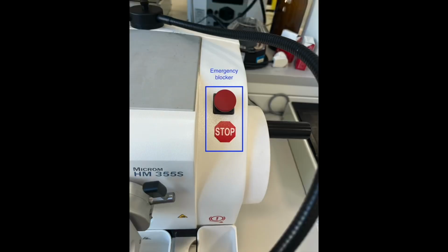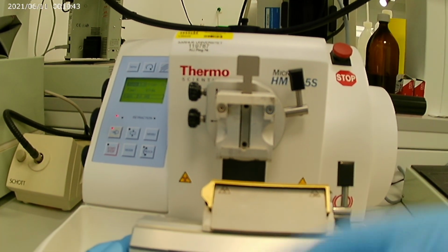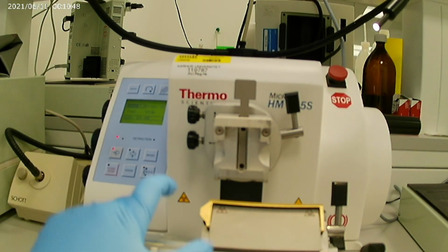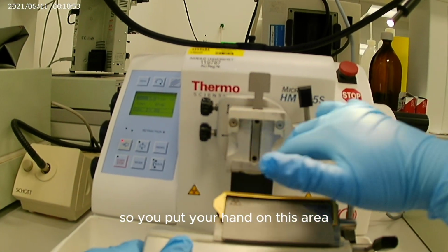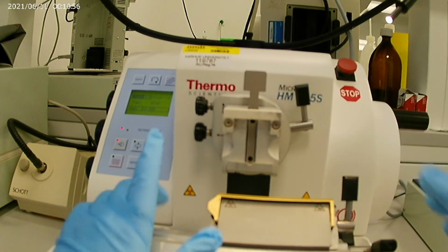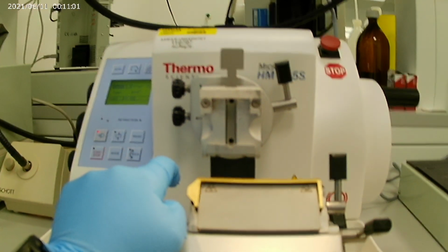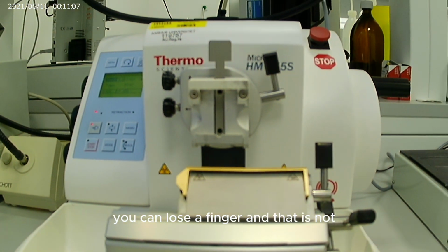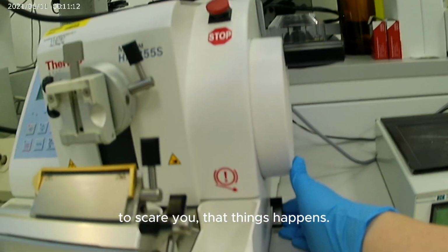Imagine that you are cutting and you see that the block is at risk, and then you just try to touch it. So you put your hand on this area, and if the microtome is still moving, you can lose a finger, and that is not to scare you. Those things happen.